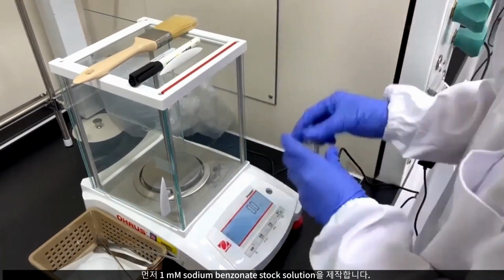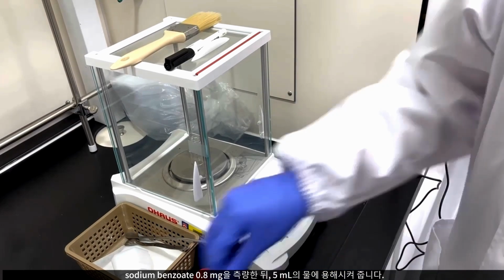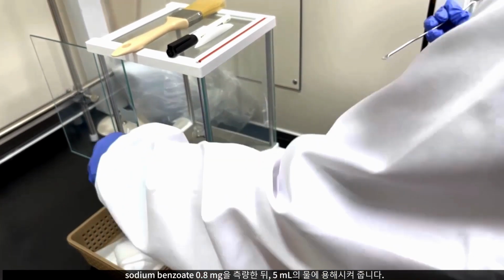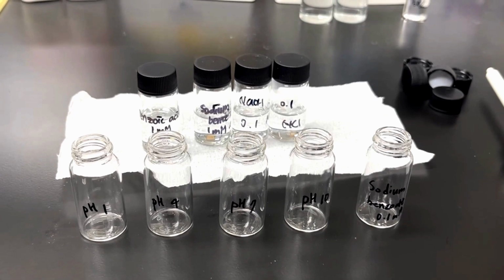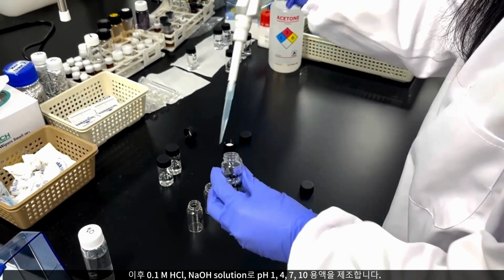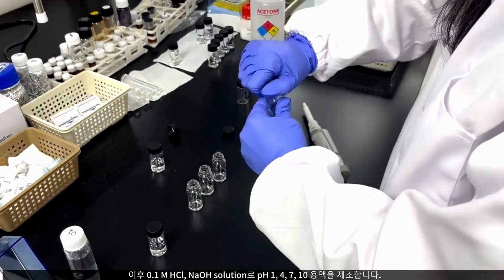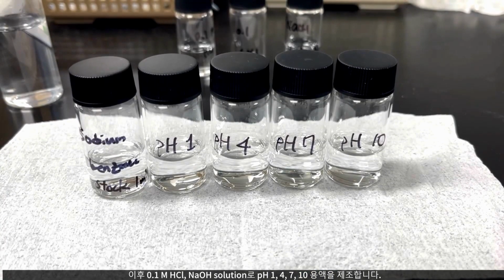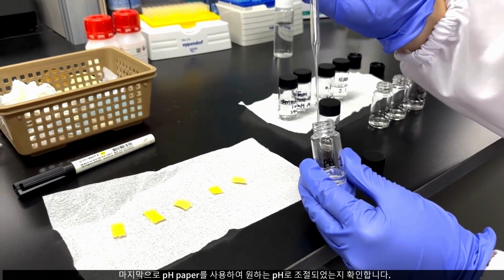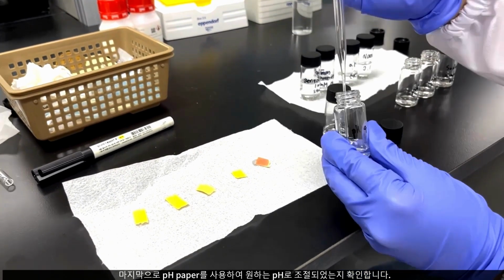First, a 1 millimolar sodium benzoate stock solution was prepared. After weighing 0.8 milligrams of sodium benzoate, it was dissolved in 5 milliliters of water. Next, solutions with pH values of 1, 4, 7, and 10 were prepared using 0.1 molar hydrochloric acid and sodium hydroxide solutions. Finally, pH paper was used to confirm that each solution had reached the desired pH.